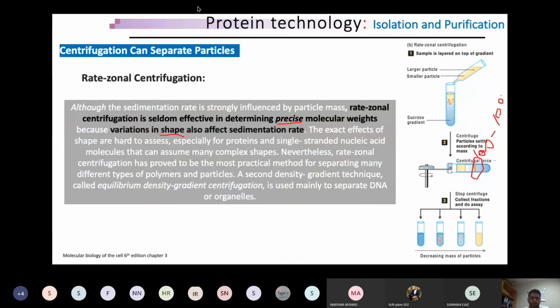So you can separate that protein out. So you might be more precise, and you can look at this fraction further for further experimentation, and you could rule out further. So it's more precise than this one.